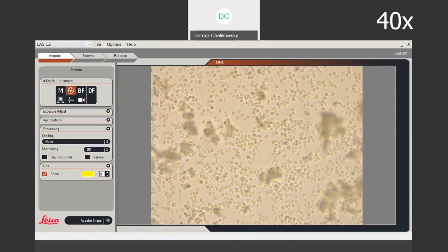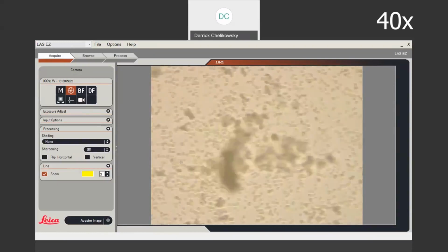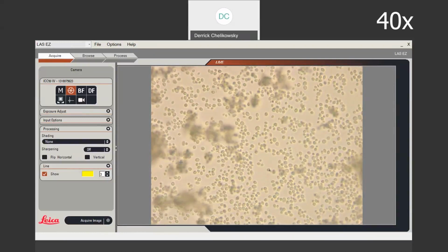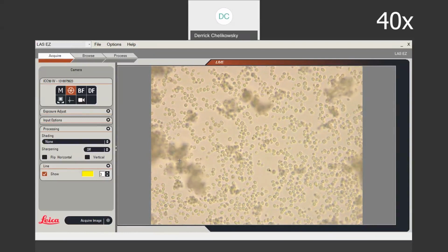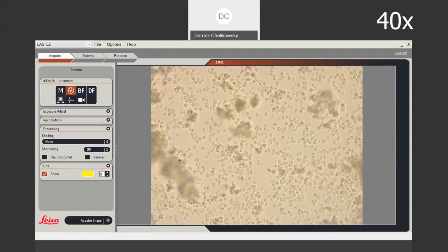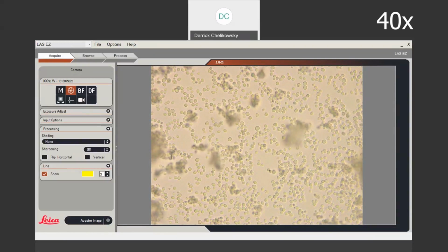The yeast cells exist in the media around them, which again is sterile water and dextrose in this case. And as they're existing, they don't move by swimming. They move simply by the shifting kinetic forces around them.